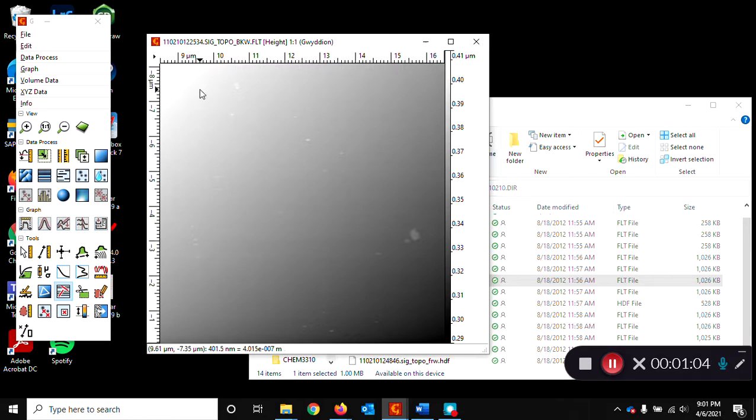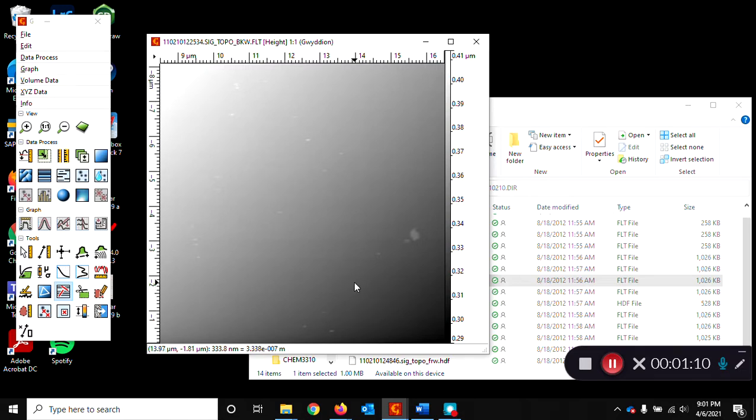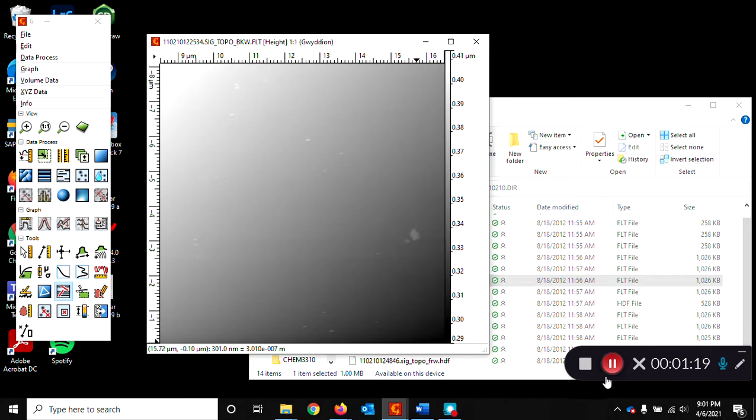Now you can see the image isn't perfectly flat. The background is tilted and so the first step we need to do before we can measure the particles is to flatten the image.